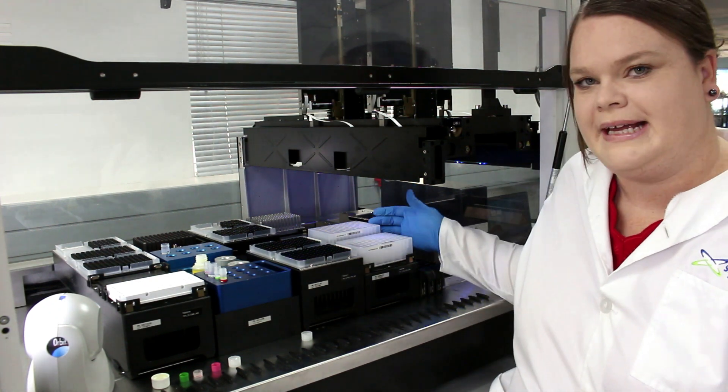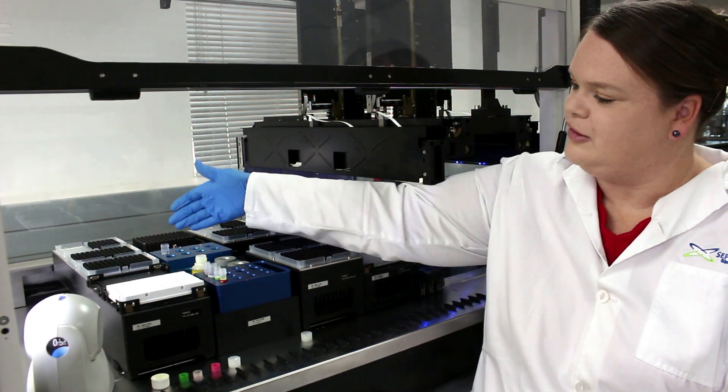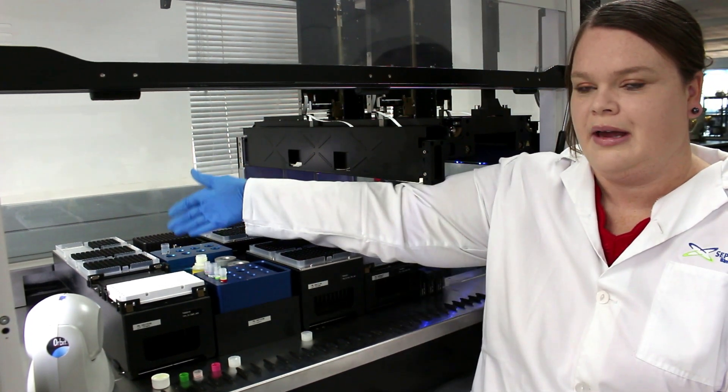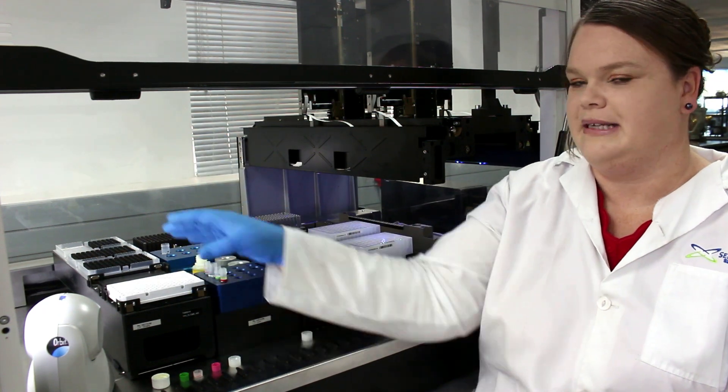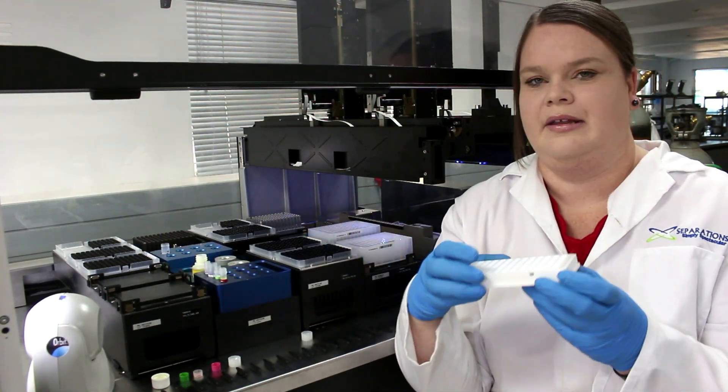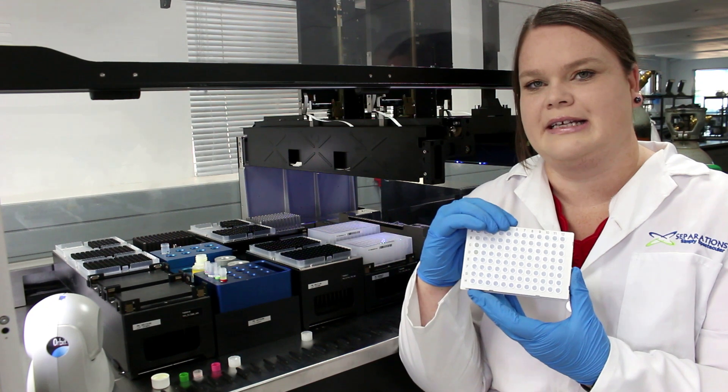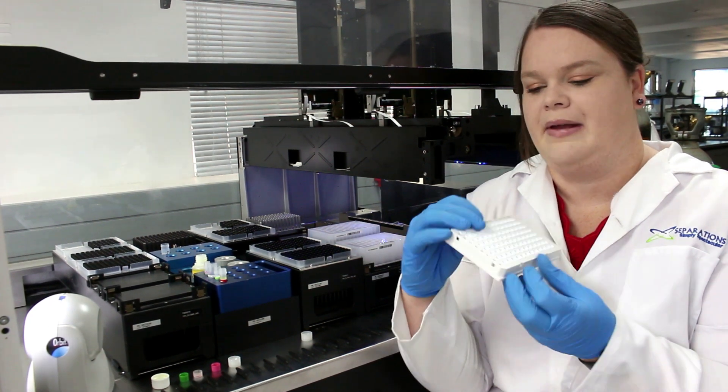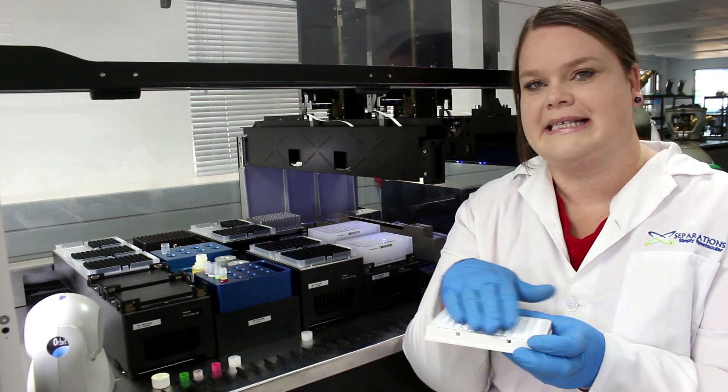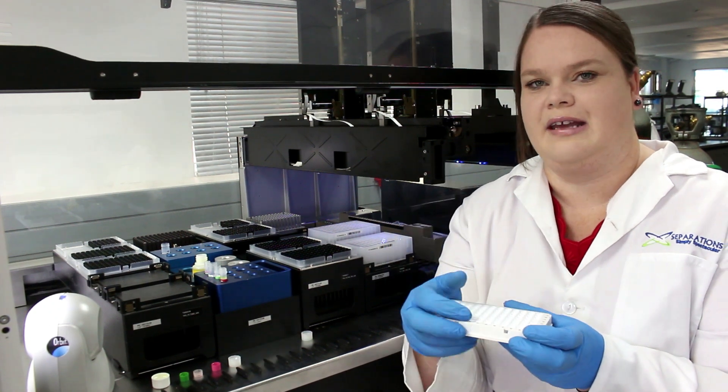The DNA extraction takes place in this deep well plate, and the PCR mix is added to the mix tube and then aliquoted onto the PCR plate. The PCR plate is also 96 wells and at the end of the run gets sealed and put onto the CFX Opus.